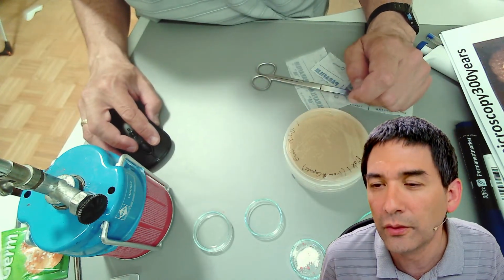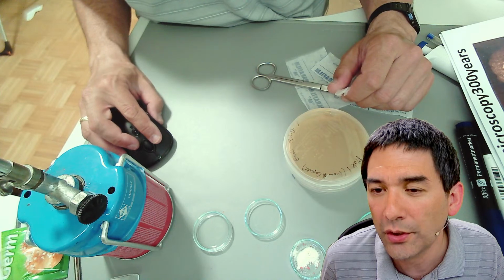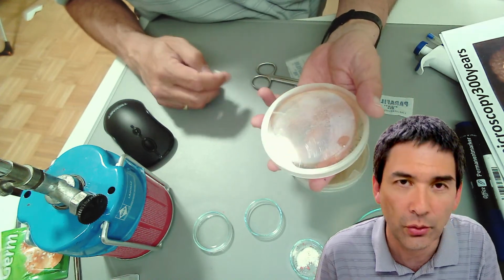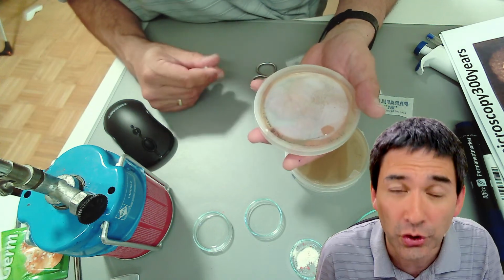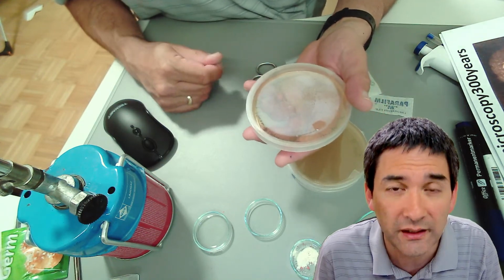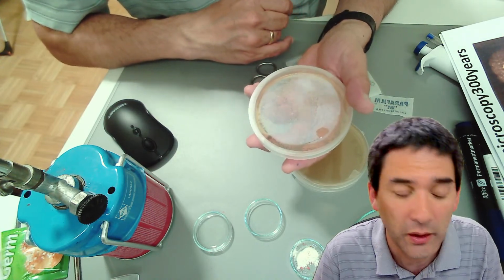So let's move on here. So how do you safely clean the object glass afterwards? Generally, what do you do with those Petri dishes once they're not used anymore? They go into an autoclave. This basically means into a pressure cooker. And they're being autoclaved for about half an hour at 110 or 120 degrees centigrade, and this kills off everything. Of course, the agar medium is going to melt as well.